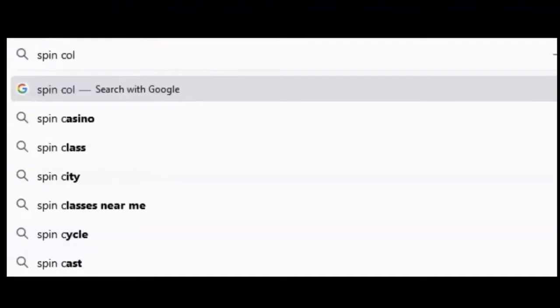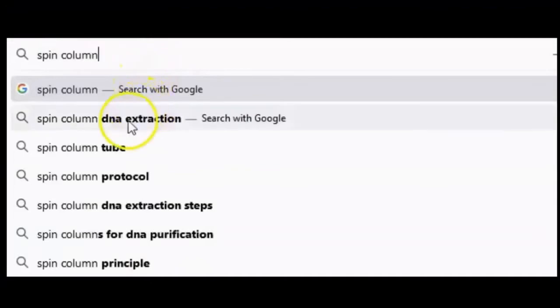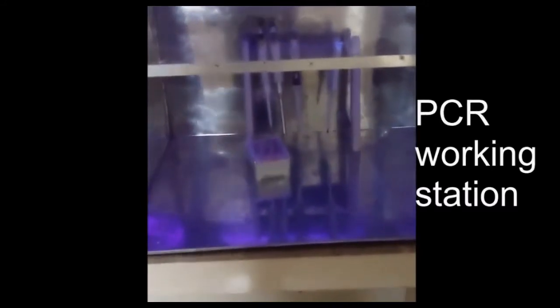Hello all. Today we will use one of the famous methodologies in COVID-19 diagnosis laboratories. Here is the Vortex, the PCR machine, the PCR working station, UV light to decontaminate the station, and the Safety Cabinet Type 2.